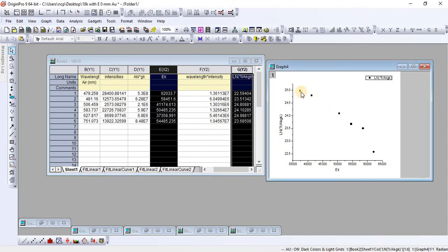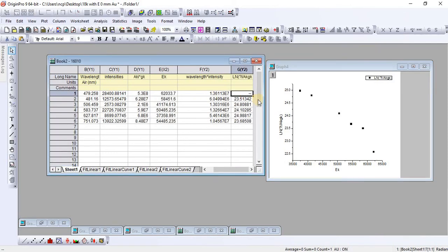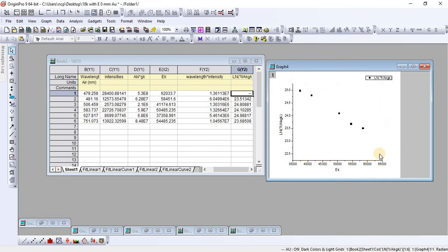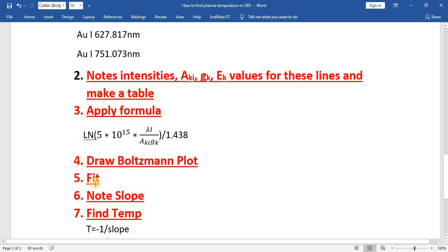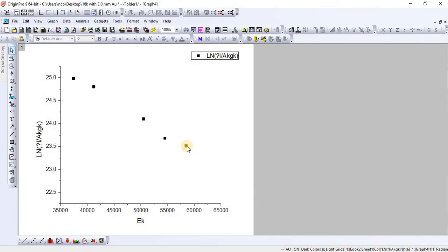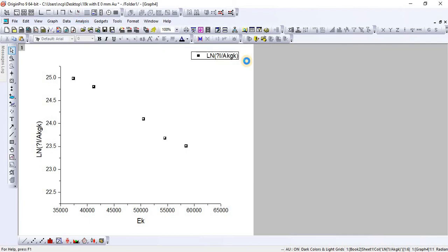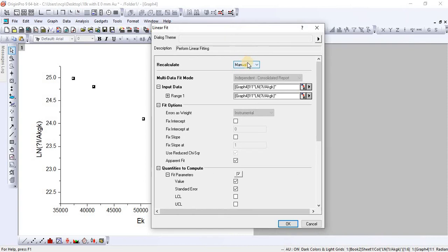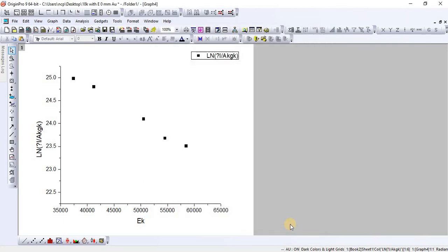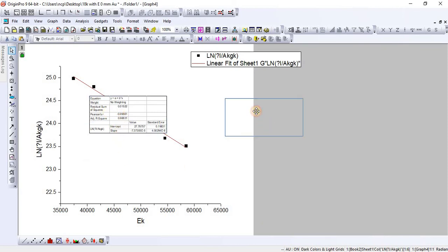Select these two columns and draw a scatter plot in points form. You can see that all the points are approximately linear. However, one point is not linear, so you can delete that point to achieve linearity. Now all remaining points in the graph are linear. To fit the plot, select a point, go to Analysis, then Fitting, then Linear Fit, and open the dialog box. Click OK — you can see that the points are now fitted linearly.